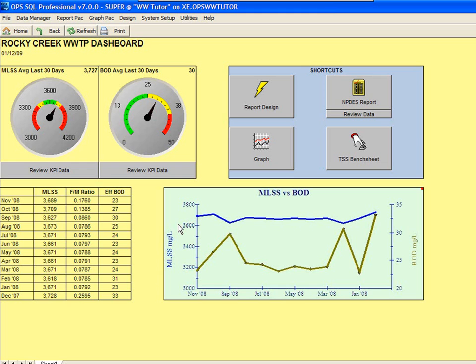In this case, I'm going to take you through an example of comparing my Influent BOD, which is a 24-hour composite test that goes to the lab, versus my Hawk UVAS data, which is an online instrument that hooks into my SCADA system. Now, the UVAS reading represents a UV absorption reading of the organic material in your influent stream. So it's a very good correlation to the BOD. It should be a little bit higher because it represents the total organic.